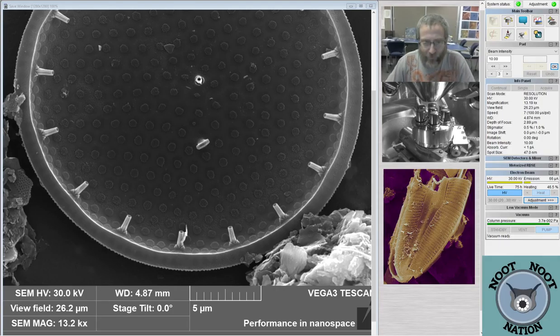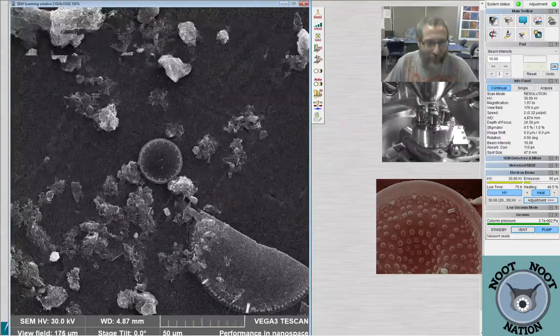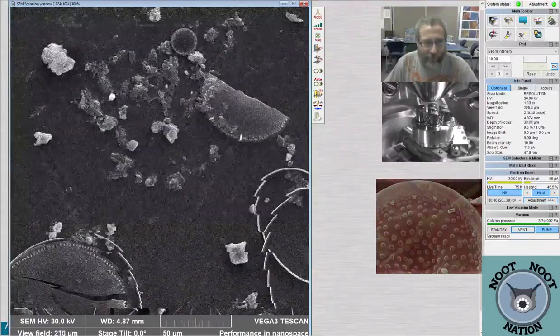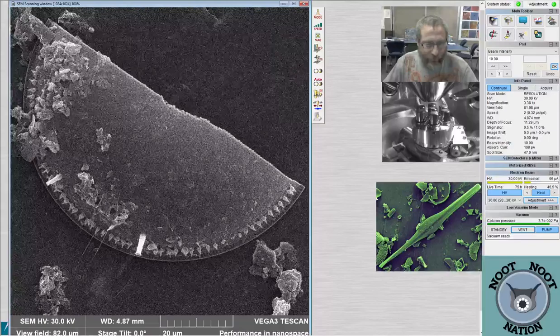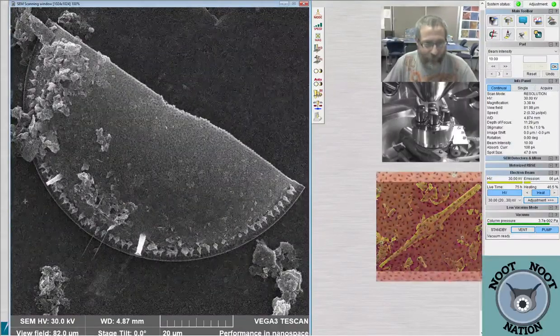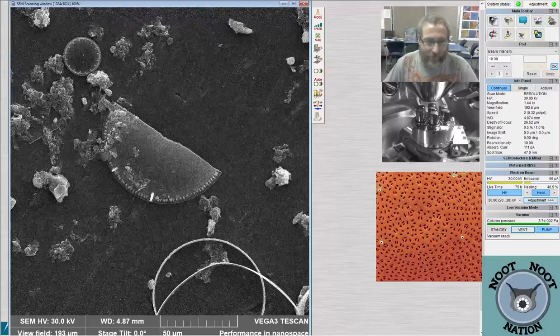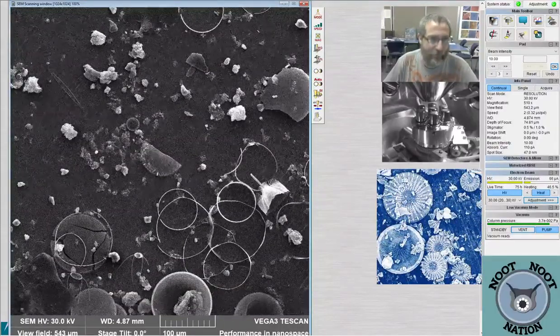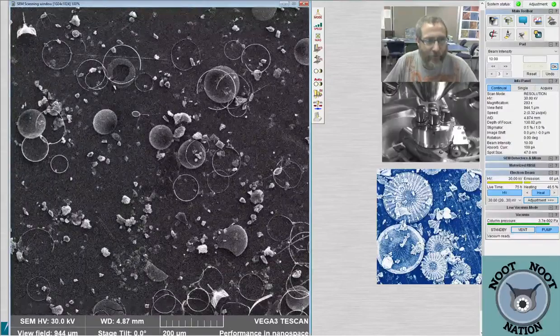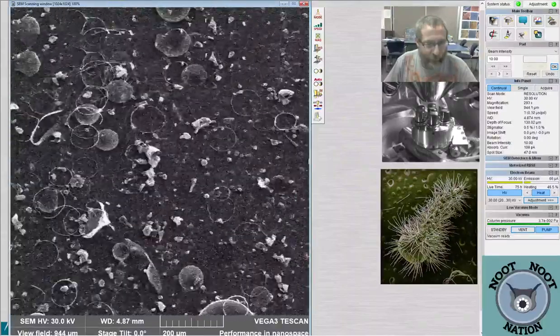I'm going to call this one not Thalassiosira. That's about all I could figure out so far. So just as an example, I was talking about how Thalassiosira have a rimaportula associated with a big long tube, and here's an example. So these are strutted processes around the outside edge, and then these are rimaportula extensions right here. So this thing's flat, and it's laying flat, which means that it doesn't have any of these. It's not elevated up off of the surface, so it's not like it has 4 or 5 of them or anything like that. It doesn't have a tube associated with it at all. So it's a weird, weird thing. Sometimes we find weird things. They're weird to me.